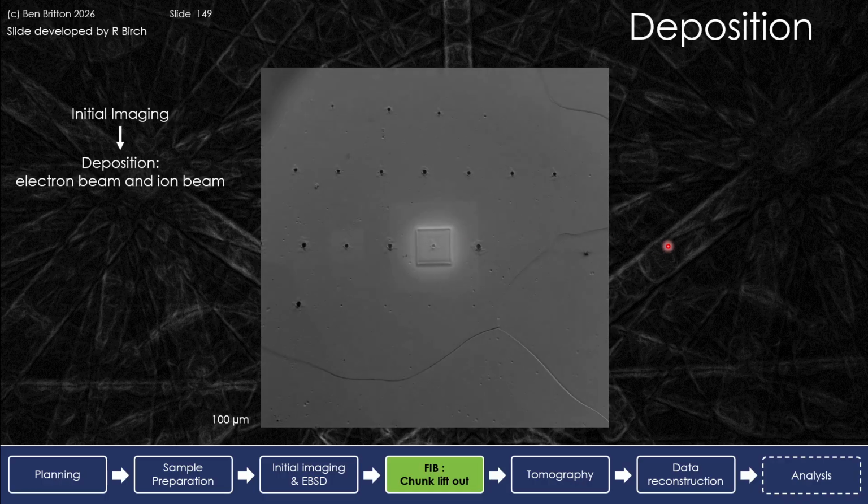So this is the deposition process, a nice little video to show you that. That's the I-beam deposition, I believe, given the height that's going on in here. So we're going to build up the deposition, and we basically can start to see the residual indent, the relief in that indent as presented.